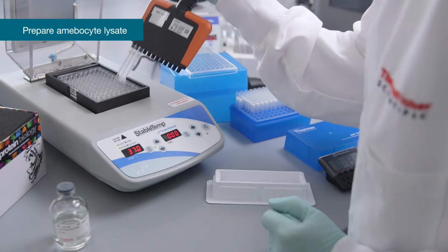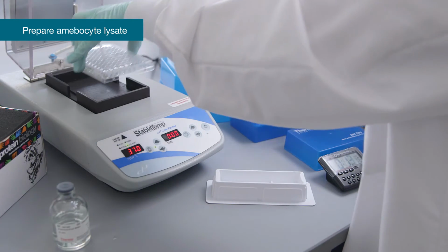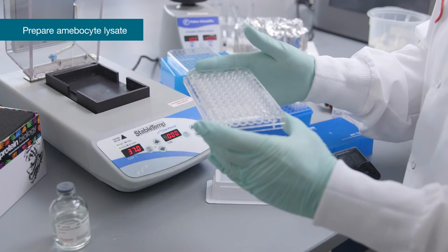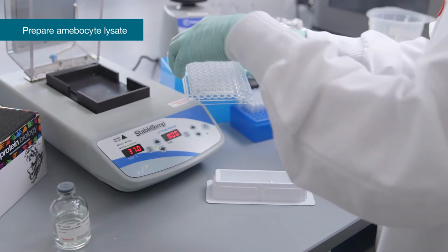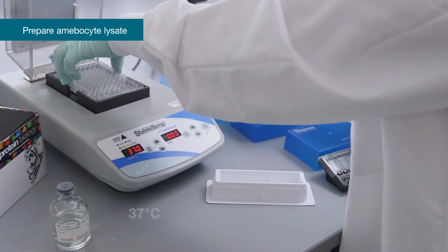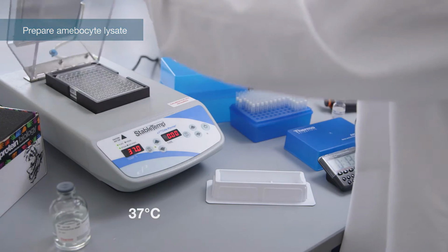Once the amoebocyte lysate reagent has been added to the plate wells, briefly remove the plate and mix by gently tapping 10 times on the side of the plate, avoiding spilling. Return the plate to the plate heater and resume the incubation at 37 degrees Celsius for the remaining time T1.